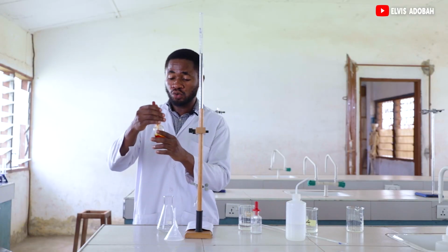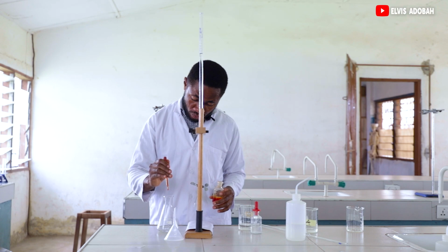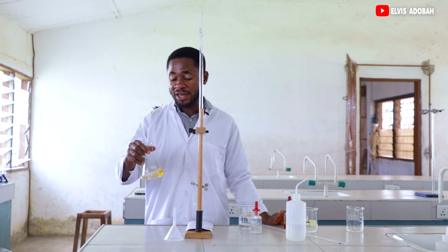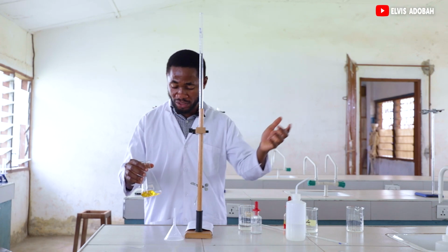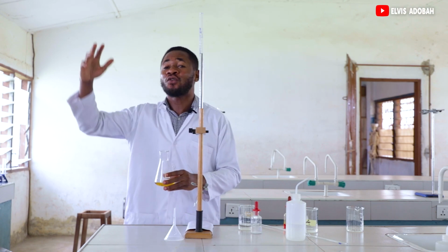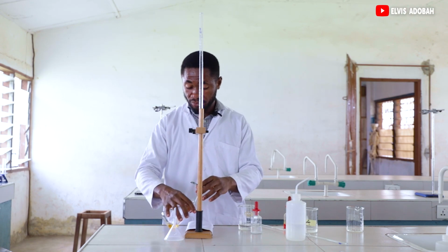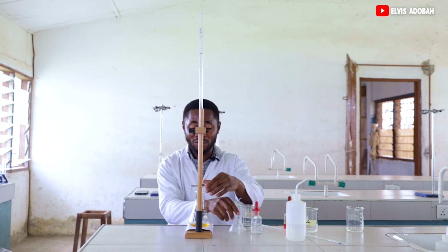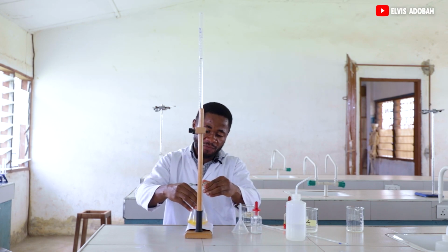Then we add 2 to 3 drops of our methyl orange indicator. 1, 2, 3. 2 or 3 drops of our indicator is enough for us to see a clear color change during the end point. Don't add 4 or 5 or more drops, please. 2, at most 3. So, this is a new titration. This time we are using methyl orange as our indicator. And now are you seeing the effervescence?